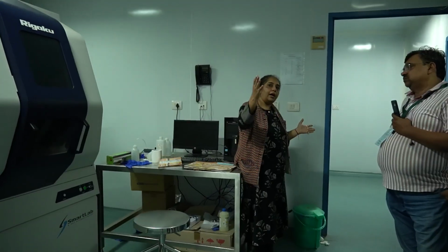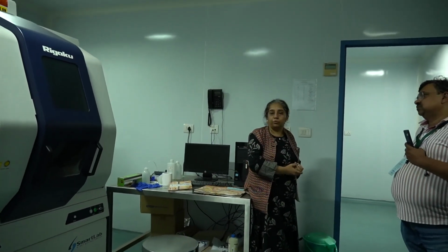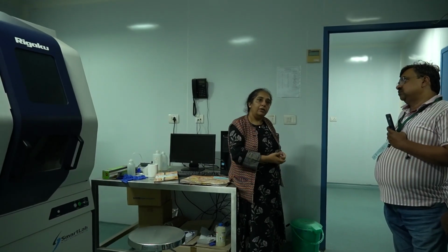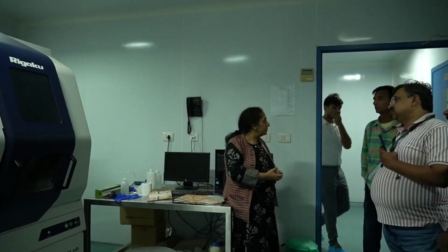Matching has to be there between whatever source we are using and what we are seeing. Like you have to decide where to use a knife and where a sword. So it depends upon what you want to see; tools should be of that resolution only. So the first point is that this is used for the determination of crystal structure. Whether the material is crystalline, amorphous or polycrystalline, all these 3 can be determined through X-ray diffraction.